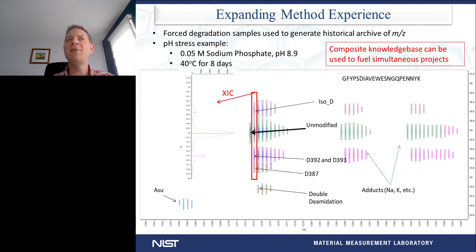So we can now associate these relative abundances on a very mass-specific level. We can actually quantify the isoaspartic acid, the unmodified, in each of the individual deamidation events. And we can do that based on mass as opposed to just a signal associated with the UV. So we can actually get much higher selectivity for our quantification to, again, monitor individual attributes of this peptide much more selectively than we could with UV analysis.